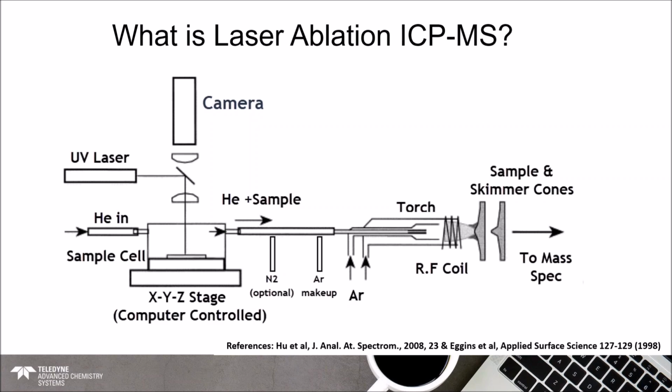You'll notice that the camera itself sits directly above, in line with the sample, which is extremely important as it allows us to view the spot without having to have it off axis and view on an angle.